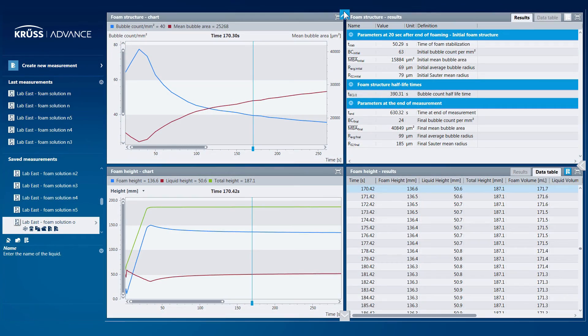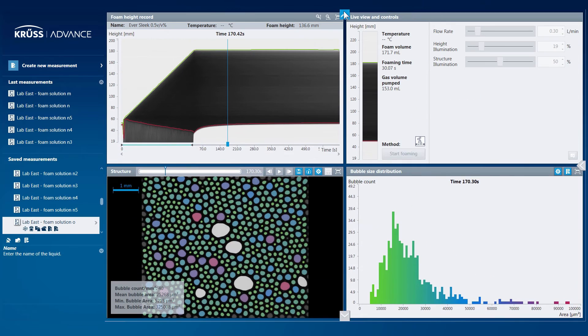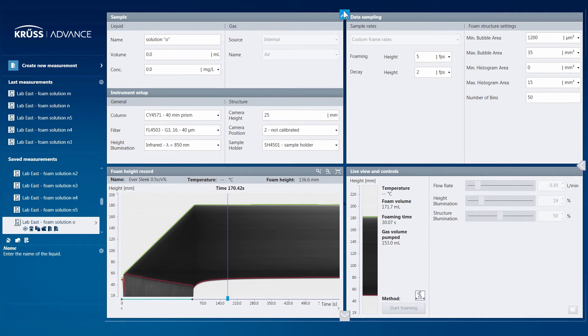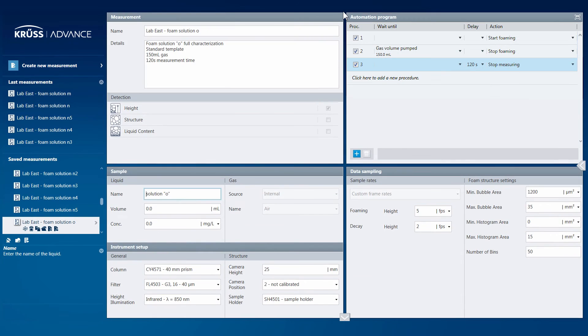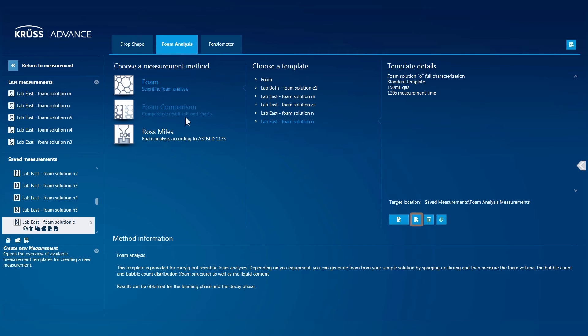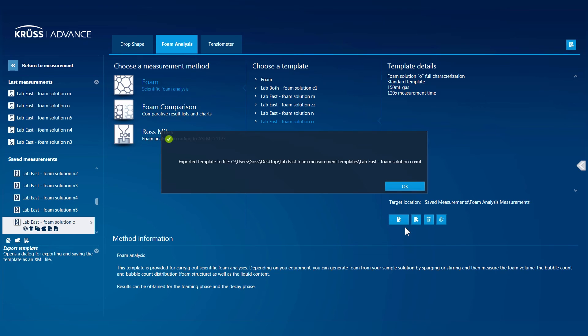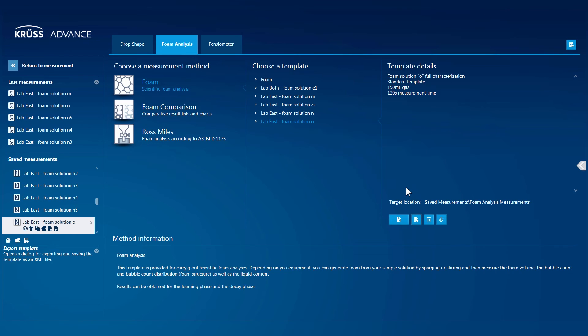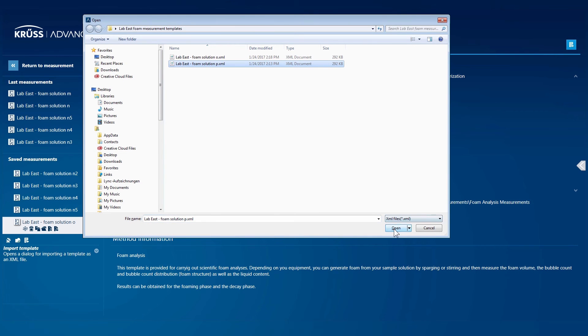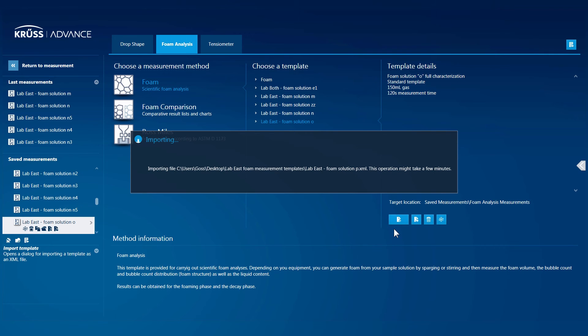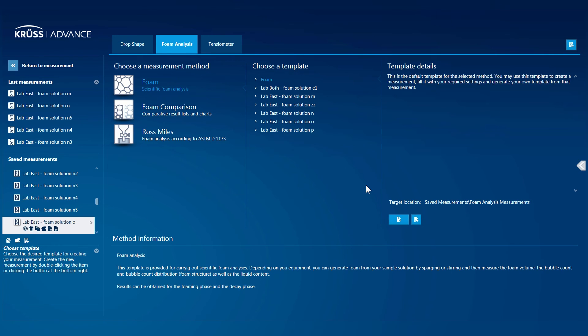Templates, including the predefined data analysis display setting, measurement configuration, and automation, can be exported and imported so that you can share them with other colleagues using Advance, and they can perform their measurements exactly as you performed yours.